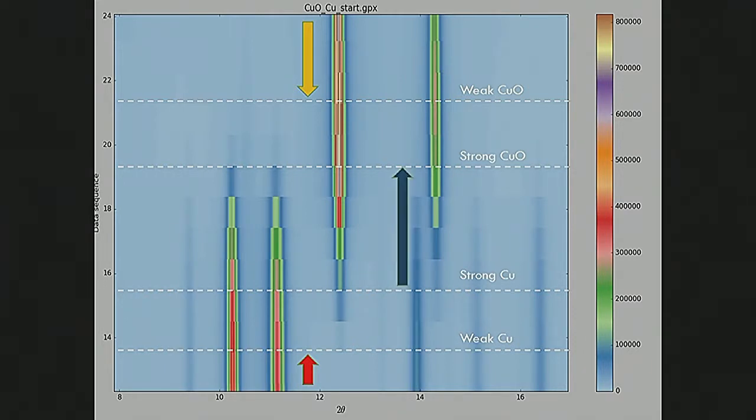However, after you do that, you want to go into the intermediate region here and attempt to refine that. Again, this is a long, arduous process if you were to do this one refinement at a time. That's what GSAS excels at. Finally, you want to go across the entire thing and make sure that everything is self-consistent. We didn't do every single one of these sequential refinements.